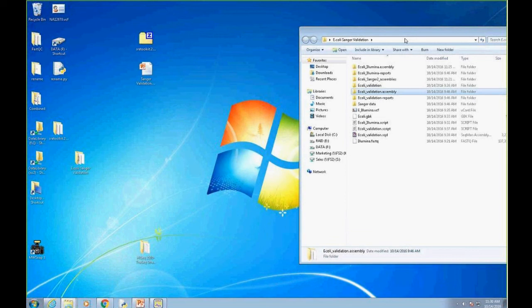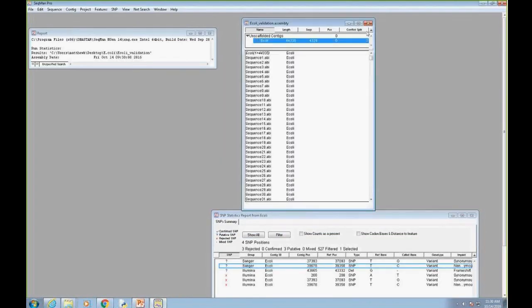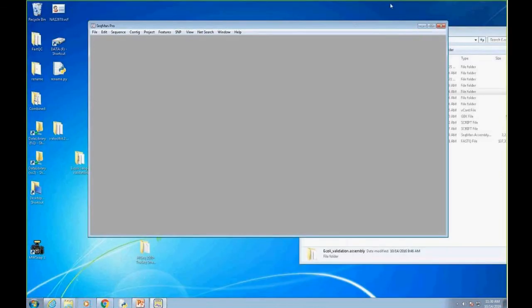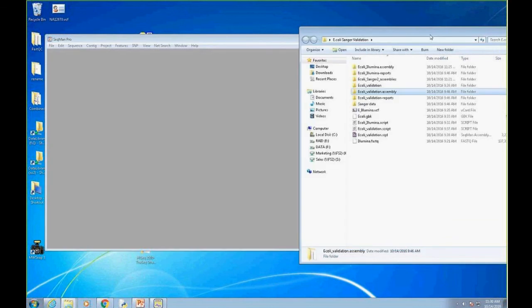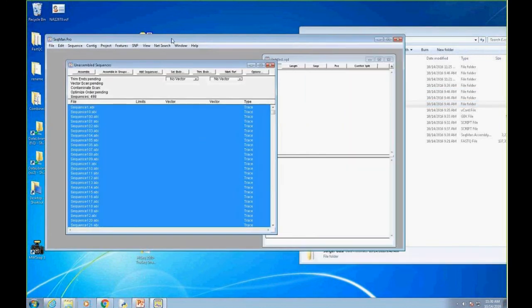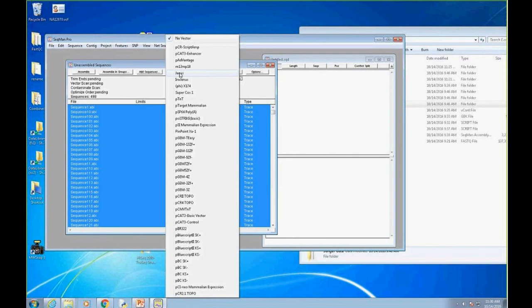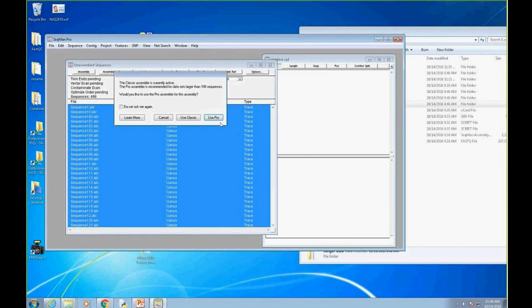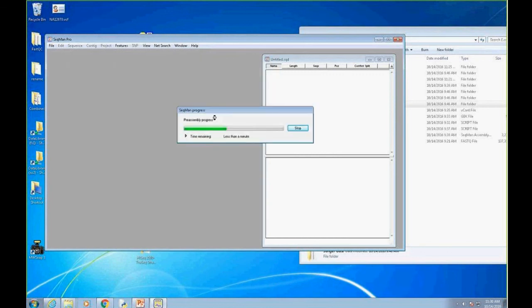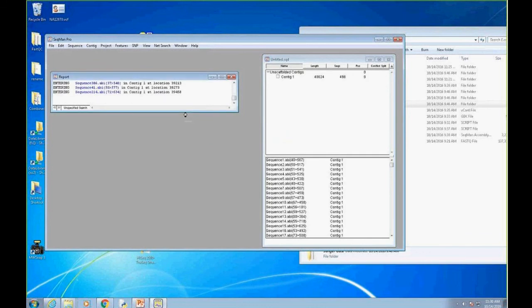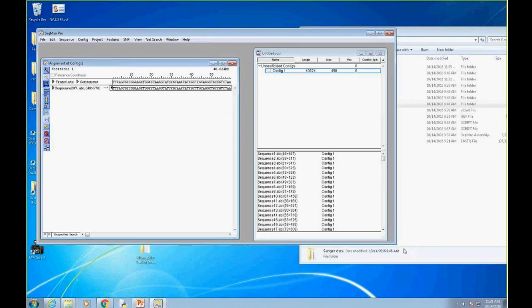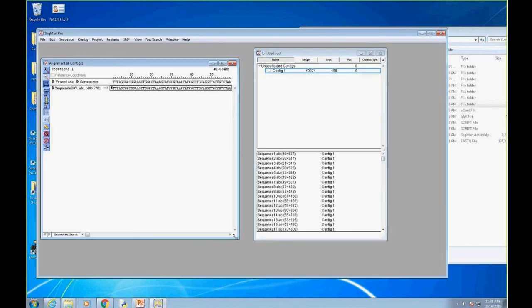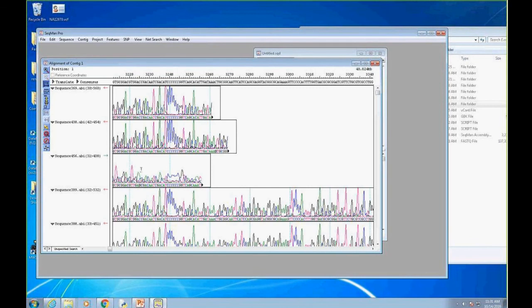The next question is, what if I only have Sanger data? Do I use SeqMan NGen to assemble that? You could, but we also have SeqMan Pro, where we're bridging NGS and our classic molecular biology tools. SeqMan Pro alone is great for aligning Sanger data. I can open SeqMan Pro and drag this folder of 500 Sanger reads. I can bring them into SeqMan Pro and it's got its own great assembler. This is a de novo assembly of those reads. It's an extremely powerful Sanger assembly algorithm. I can look at all the peaks and generate a consensus.